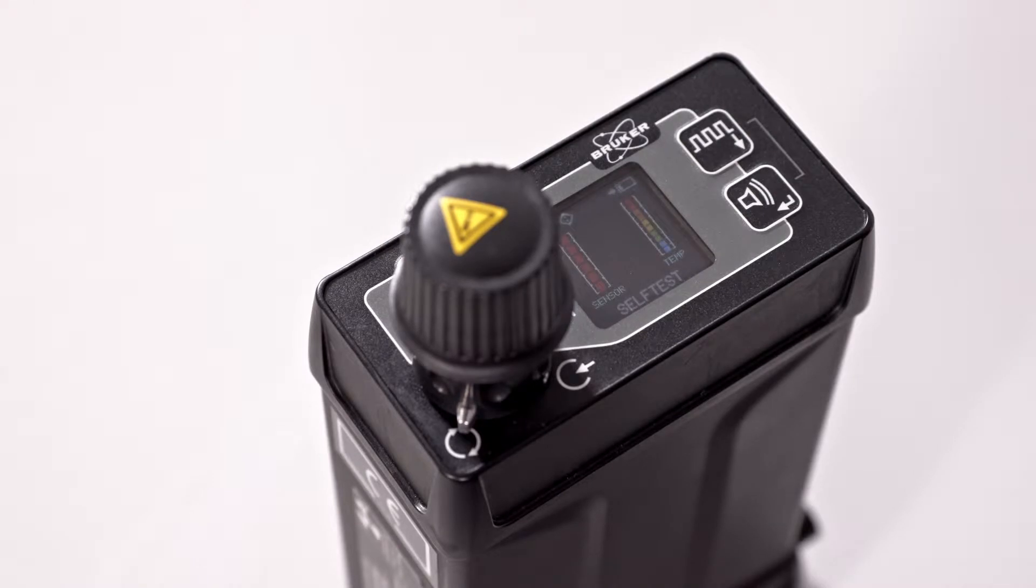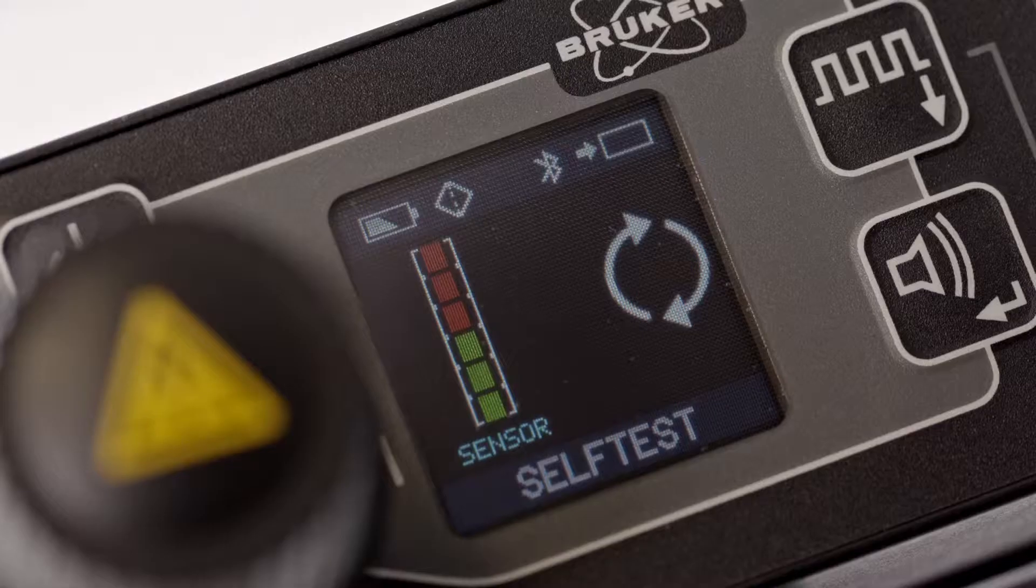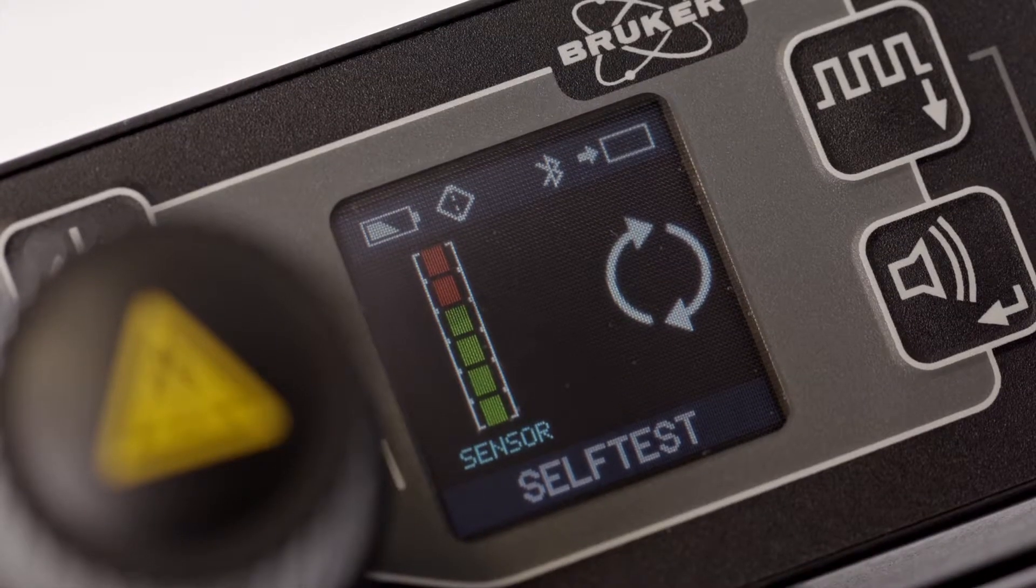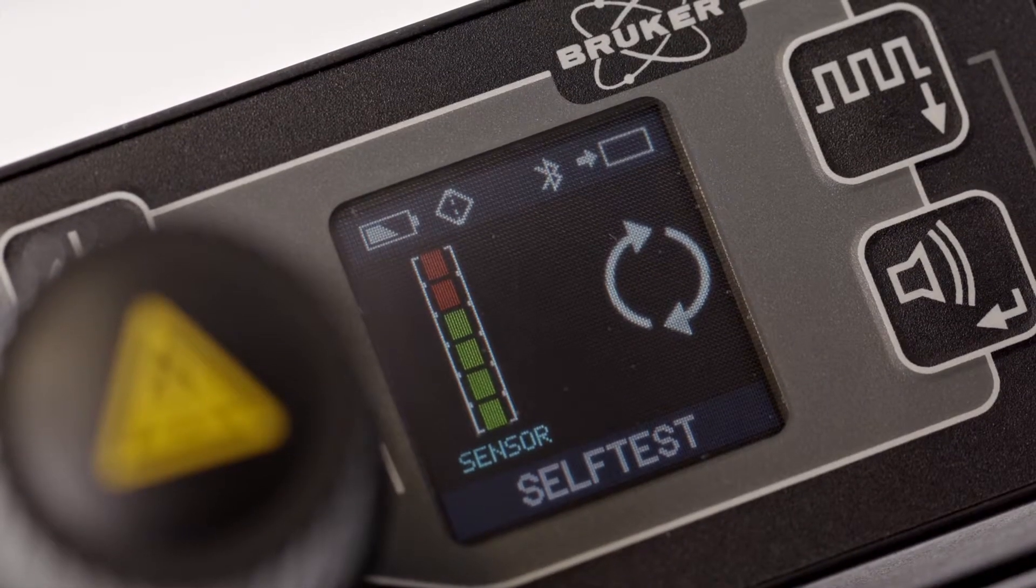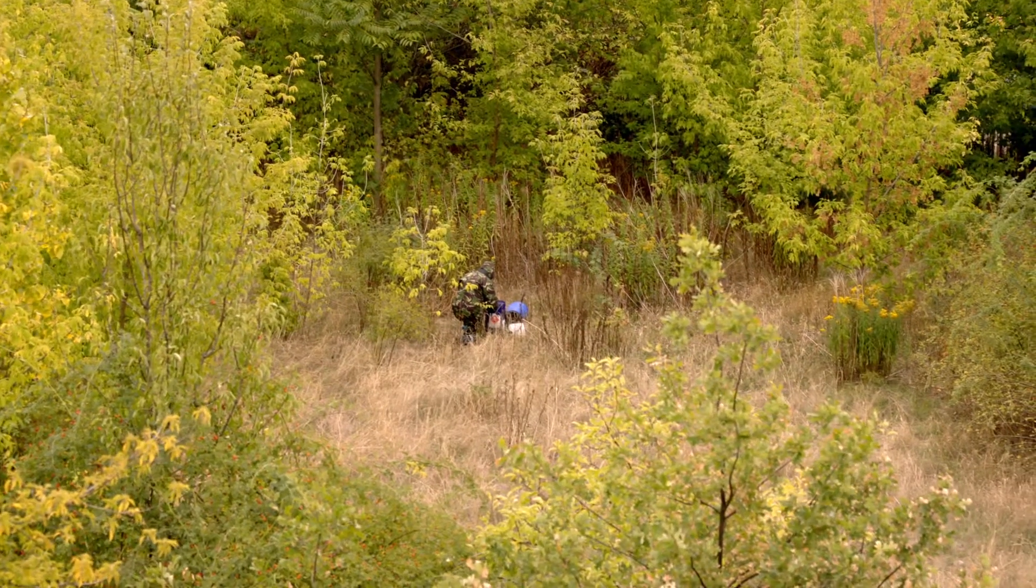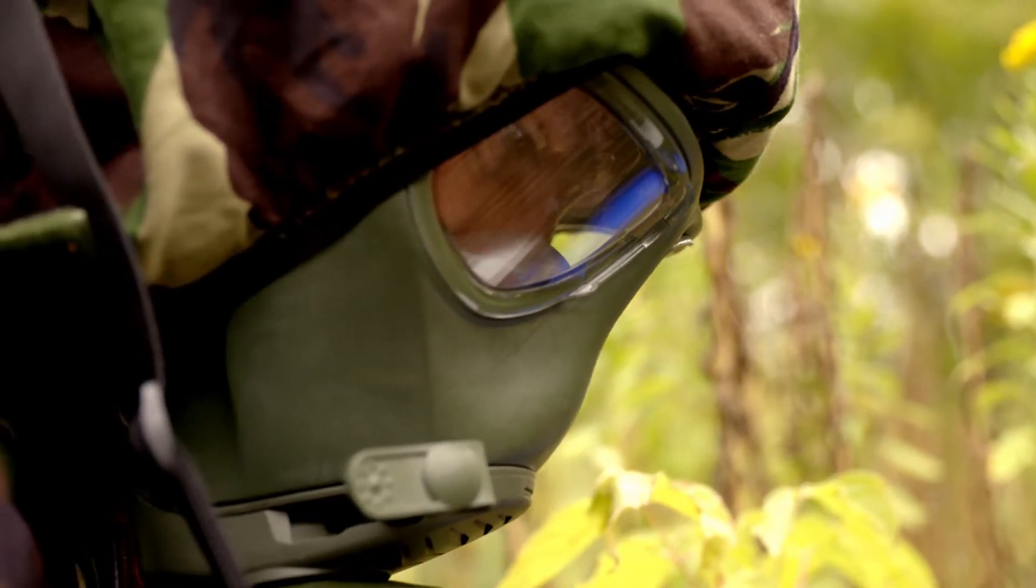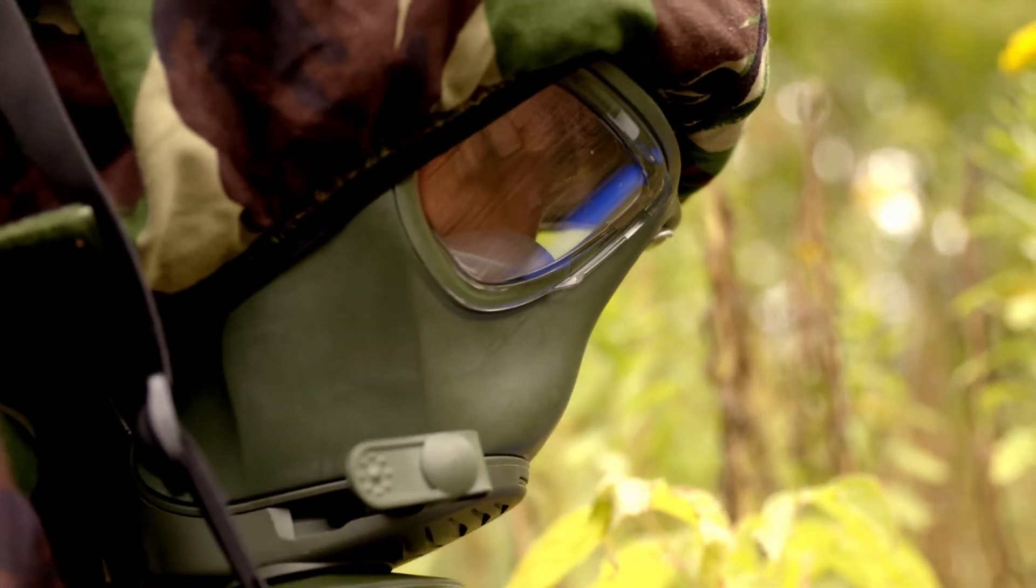When switching on the instrument, intuitive icons and messages guide the operator's use. Every action can be completed with one hand.